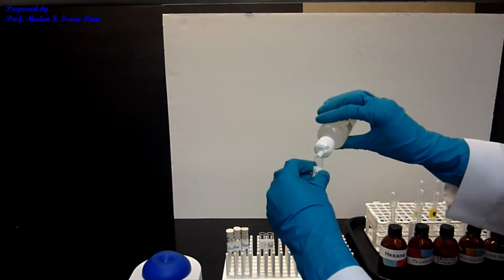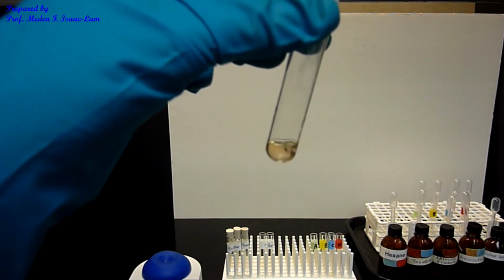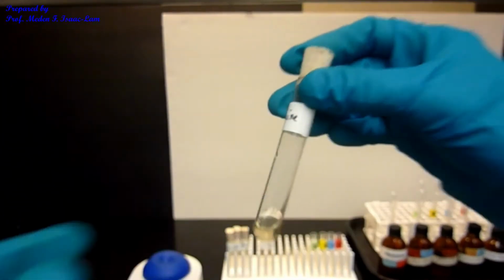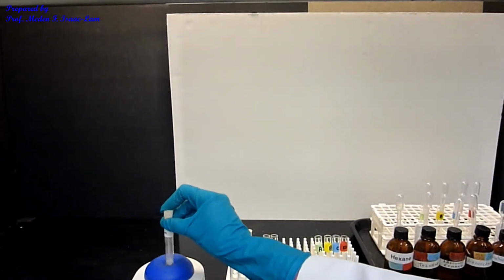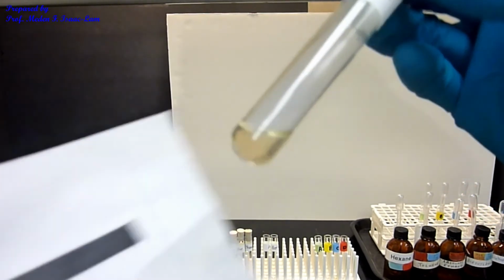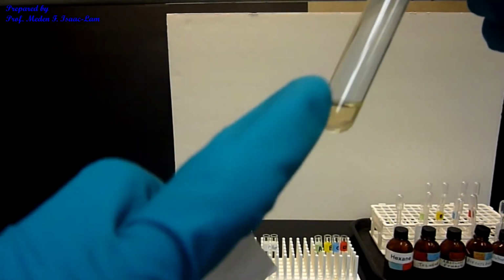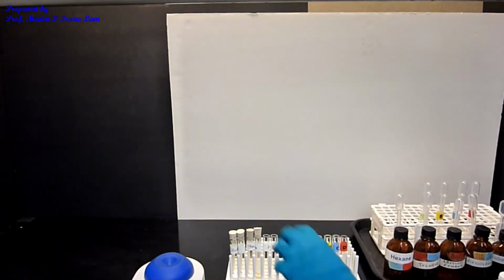So again, 8 drops. 2, 3. So you can see some, I saw some smoke and it's actually warm. Okay, so I'm gonna mix it up a little bit. You can see that there's smoke. Okay, if I mix it up, you can see some smoke on the side. All right. So I see here smoke. That was diethylamine. And now we're gonna do acetone.